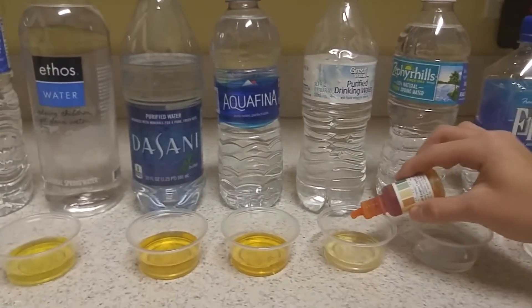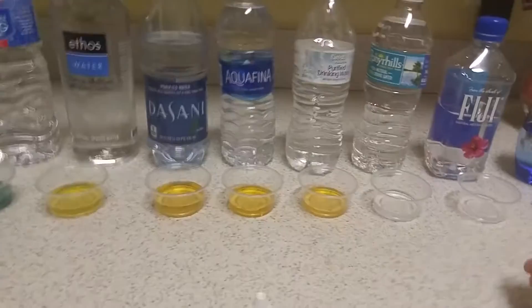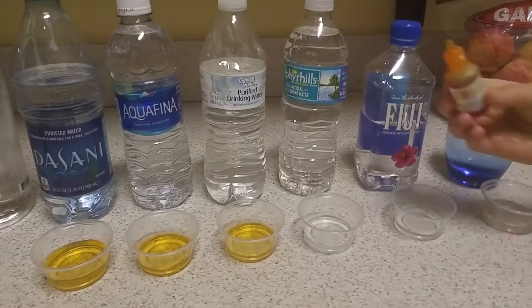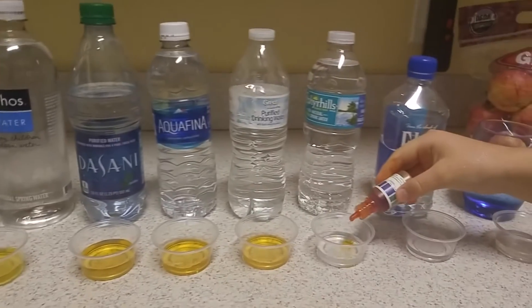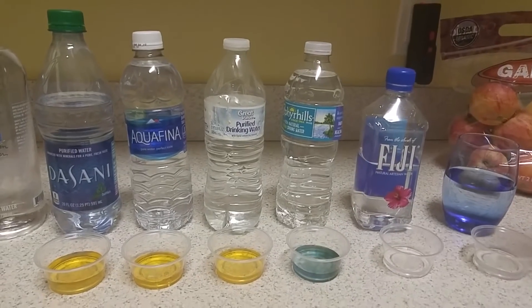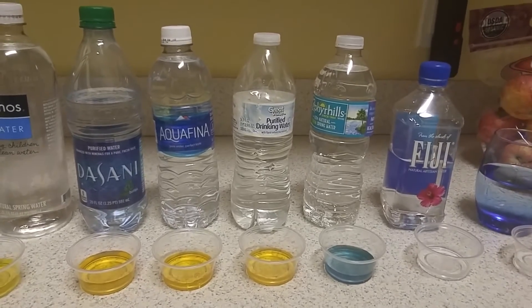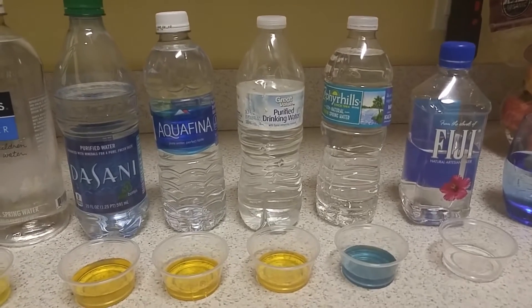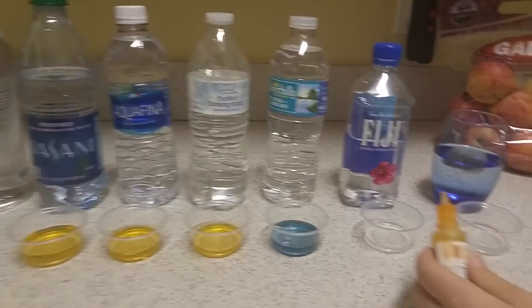Great Value, Walmart brand purified drinking water — still the same acidic result. Zephyr Hills — this is our brand in Florida. Look how many of these are so acidic. Oh, it's not bad! That passes — what color is that on the chart? That's around a 7.5, almost an 8. That's definitely neutral, a little bit more on the alkaline side.